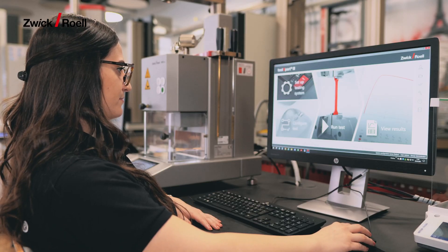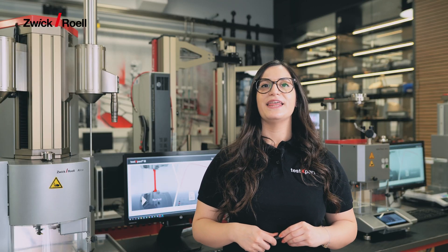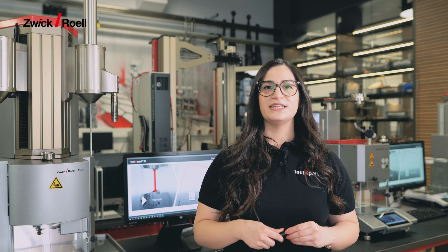If you want to test a polymer, for example, you need to know at what weight and temperature, and of course according to which standard the material must be measured. When using conventional extrusion plastometers, you have to control the volume of the polymer and also the preheating phase sequence so that the measurements start in the exact window specified by the standard.